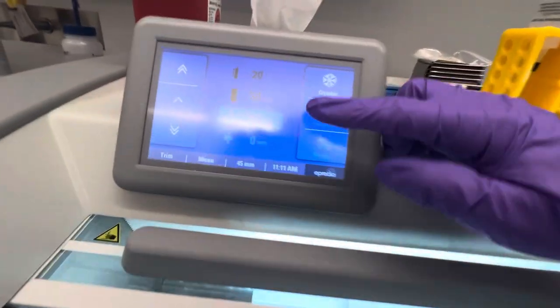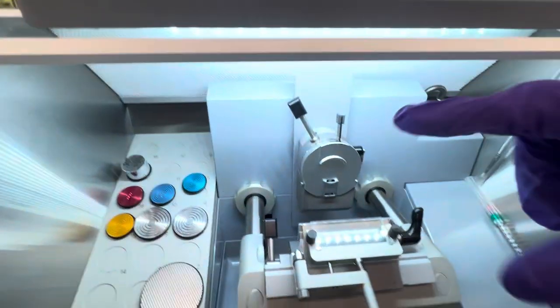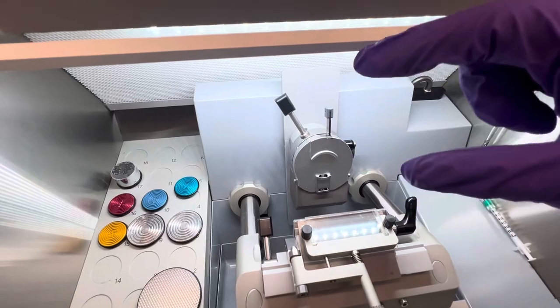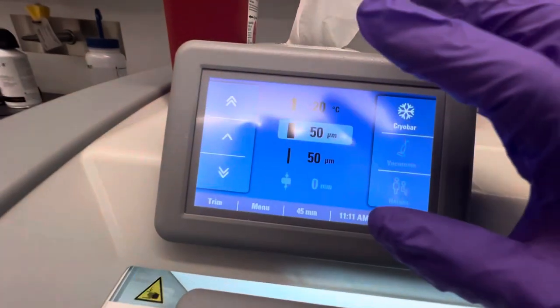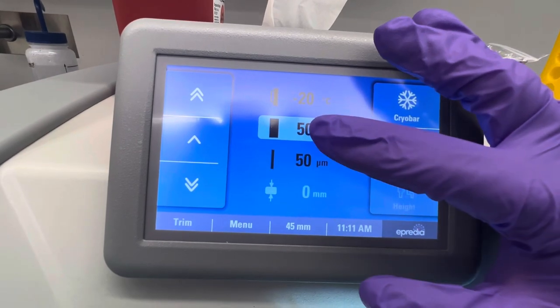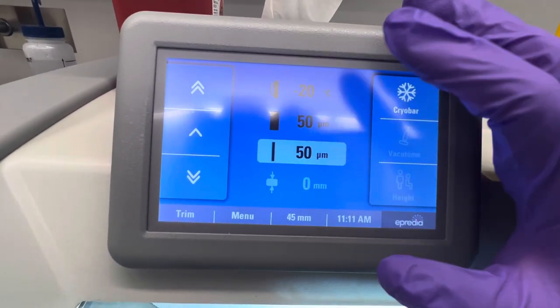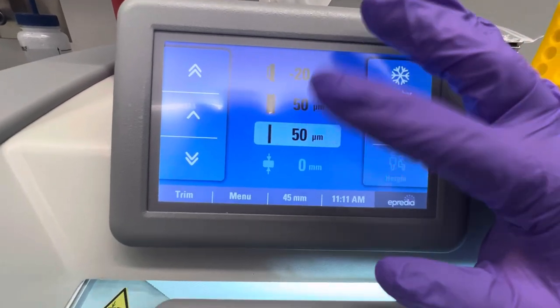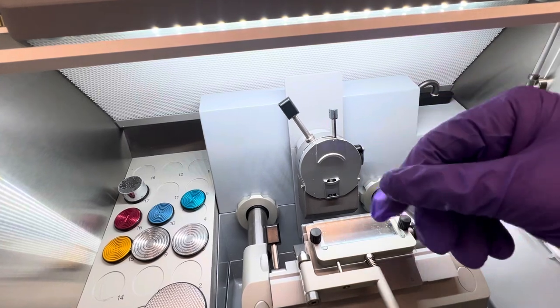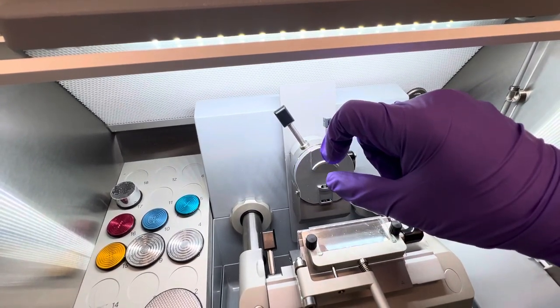Whenever you're facing off, you can switch it. Facing off is taking off all the excess OCT before you actually reach tissue in the block, so a bunch of white stuff from frozen. You can switch it to taking non-fine sections, because at that point you're just chopping things out of the way. But when you start to see even a slight shadow of tissue, you'll see a black dot almost, or a discoloration in the frozen OCT.